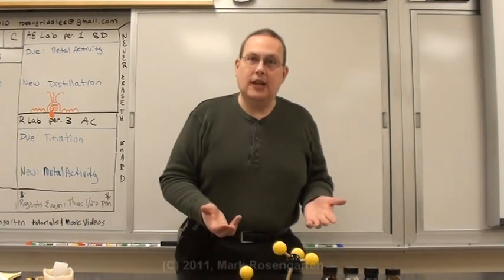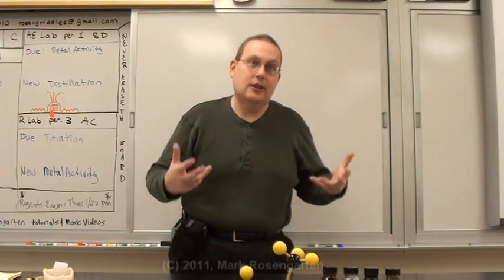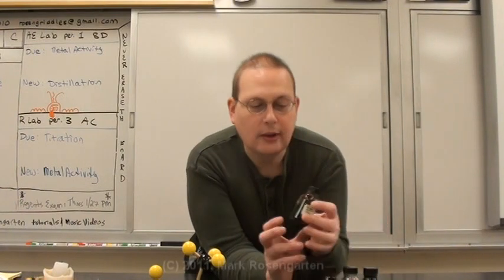When you separate a mixture like this, it's called fractional distillation because you're picking off different layers, different fractions from the mixture. Fractional distillation is very handy when you're trying to separate a mixture of crude oil.